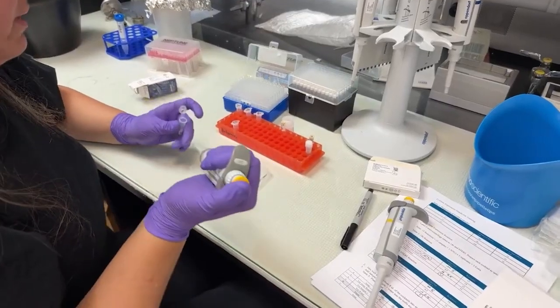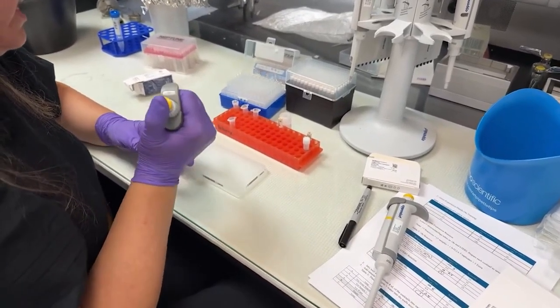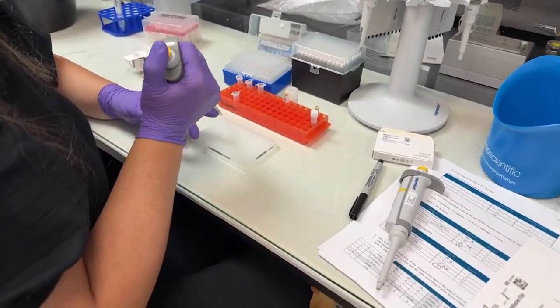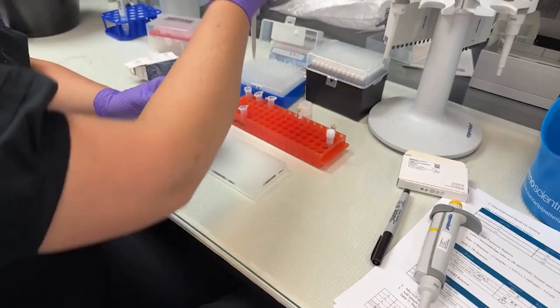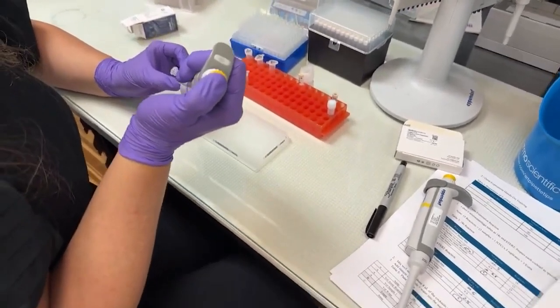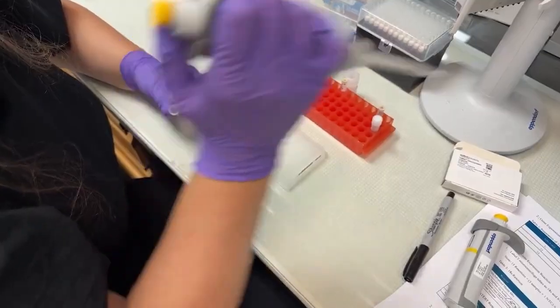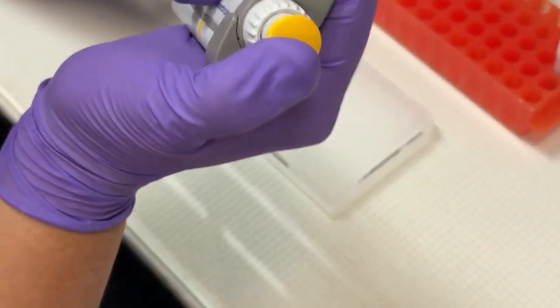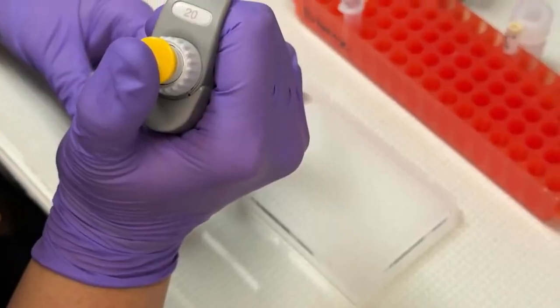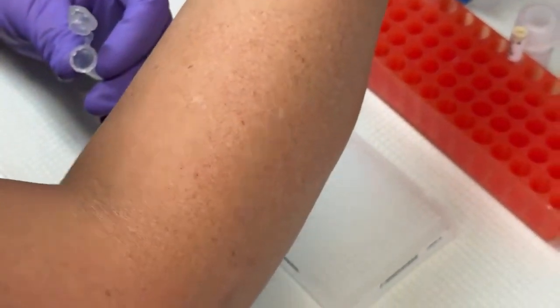So I'm going to be perfectly appropriate for all of you today, and I'm going to put 8 microliters into each well, which I know everything is clear and white and it's hard to see. So this is A1, A2, A3 with our 18S assay mix that we made.